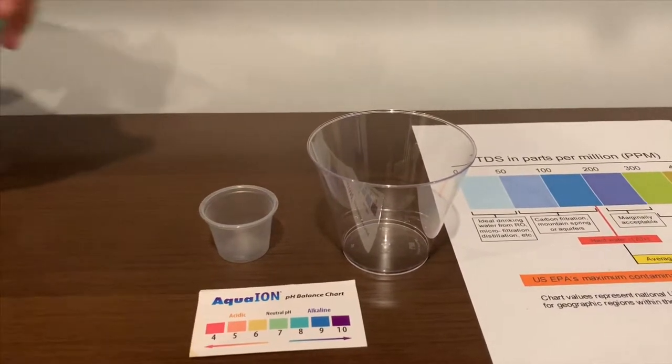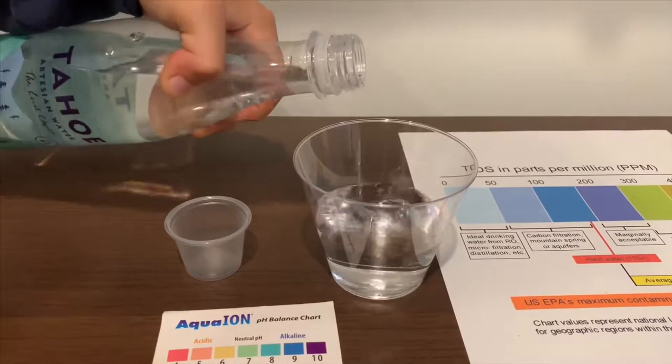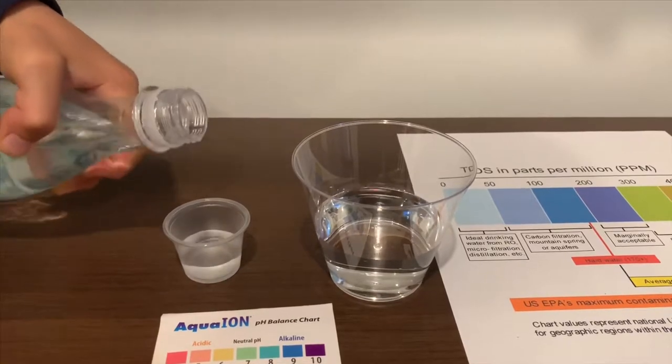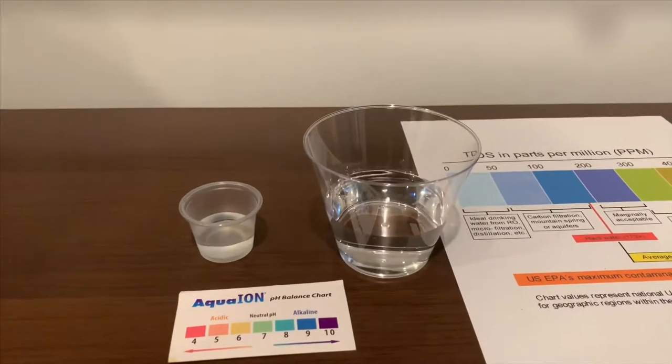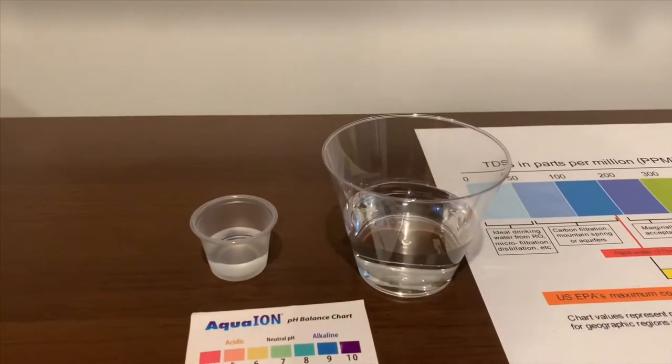Let's pour some water in. We're not going to put too much in the TDS cup. First we're going to test the TDS level.